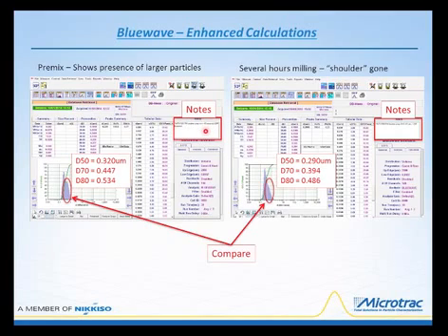if you have a Microtrac, these notes can be really valuable, and you'll notice that Tony put information in these notes. These notes are like a little word processor, and every record that's saved will have any information located in this note section saved as well. But you can see the differences in the particle size, and particularly around the 70, 80 percentiles, you can see how the data has shifted down to the smaller sizes.